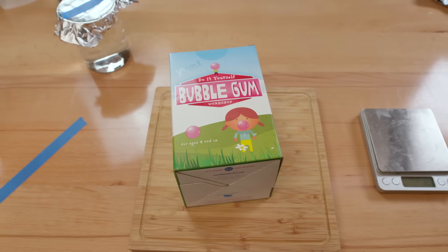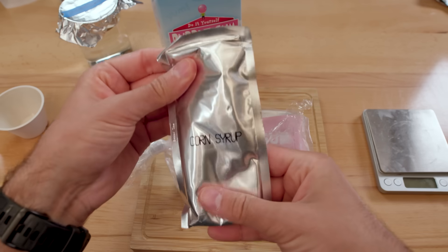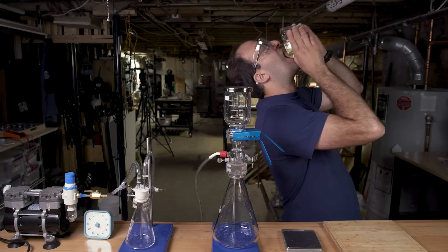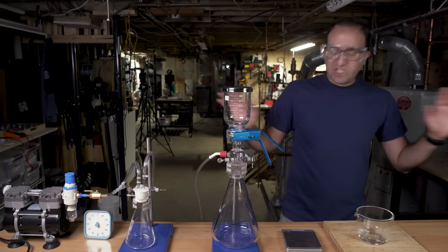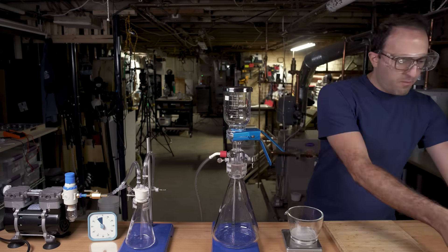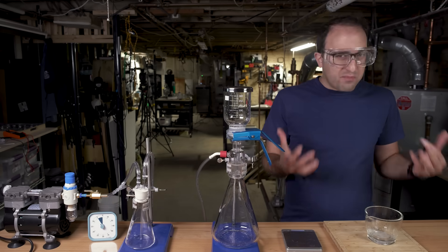But then I had a good idea. It turns out that people make DIY gum kits where you get all the ingredients of gum packaged individually — the sugar, the flavorings, the color — but crucially, you get gum base by itself. If I test the gum base alone and see the same type of particle that I'm seeing in Double Bubble and the other gums, that's pretty damning evidence that whatever is coming out of these gums is coming from the gum base. And sure enough, it is the same stuff you see on Double Bubble, Pure Chocolate Mint, and Big Red.